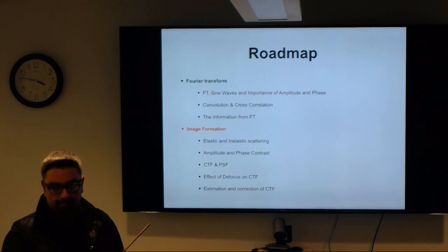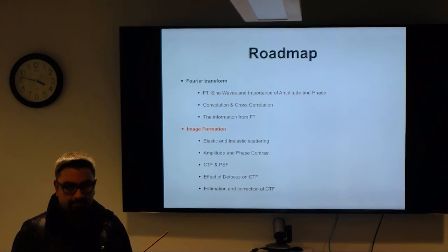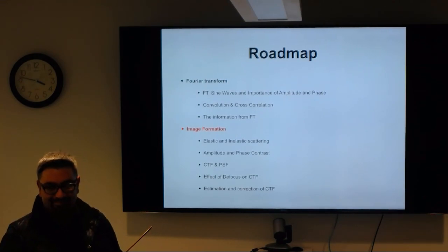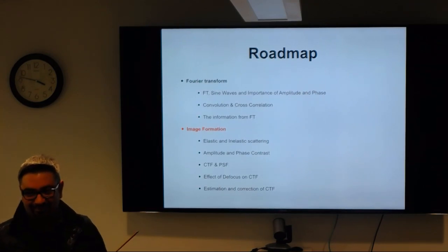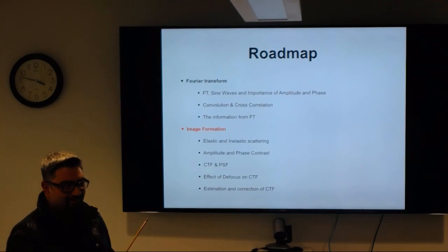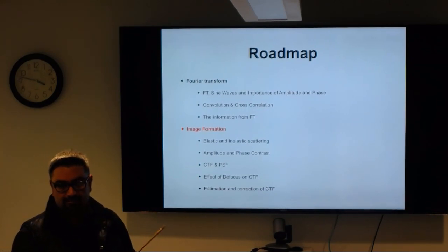There's a lot of useful information in that power spectrum that Lorenzo just showed you, and by eye, there's a lot of information we can unpack. I'm just giving you another applied application. Was that clear? The water ring is at what angstrom? Lorenzo said 4. It's a good enough estimation. It's 3.46 or 3.8. It depends on how ordered it is and what order form of water.